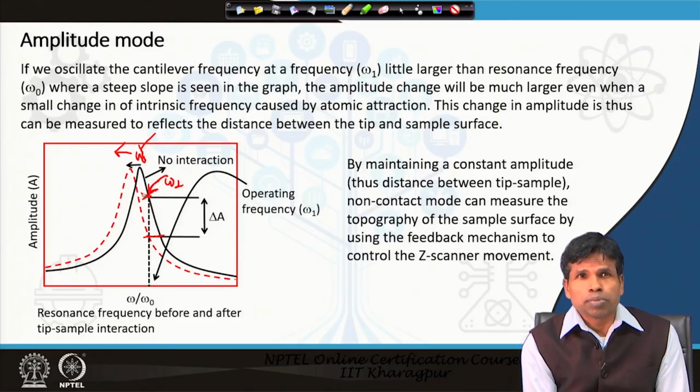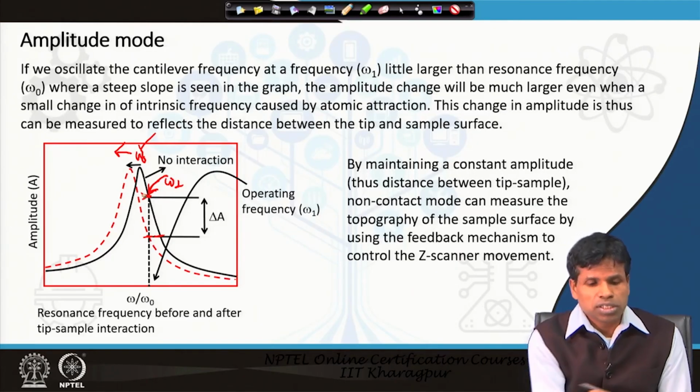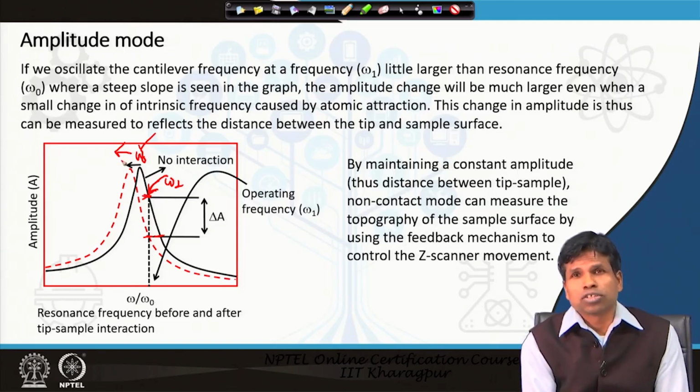This change of amplitude, because it is directly related to the frequency shift, also gives information about the tip sample gap or tip sample distance.